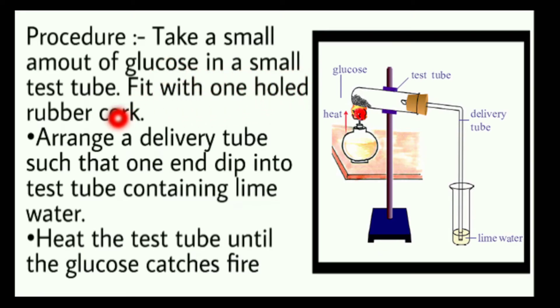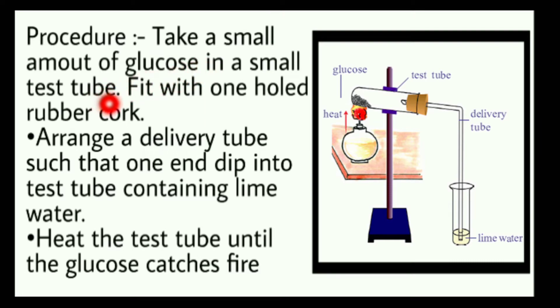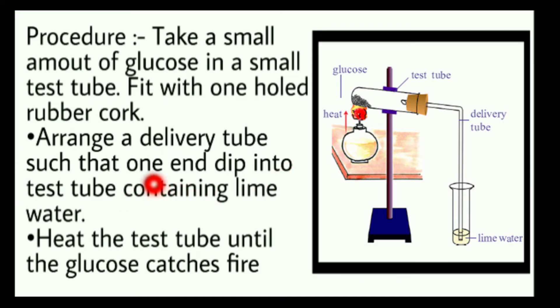We close the test tube with glucose powder, then close the tube. Arrange the delivery tube such that one end dips into the test tube containing lime water, and the other end goes into the test tube of glucose.